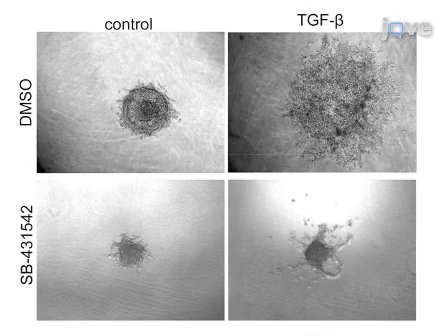The results show that modulators of the TGF-β pathway affect the invasive property of the spheroids in a 3D collagen matrix. The main advantage of this technique over existing methods, like the scratch assay, is that it better recapitulates the 3D environment. This method can help to answer key questions in the TGF-β field, such as the identification of novel genes involved in TGF-β-induced invasion.